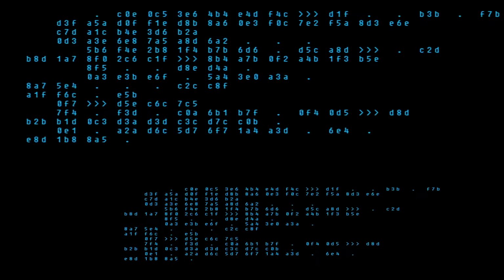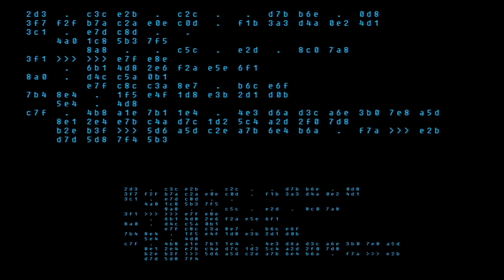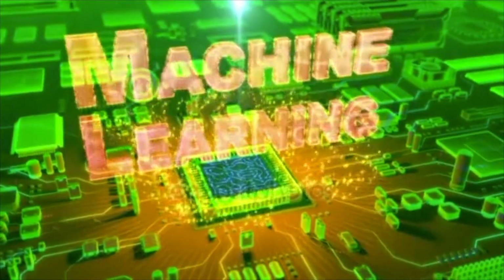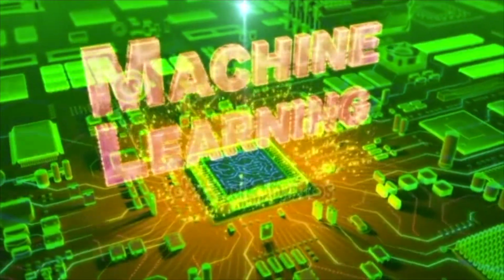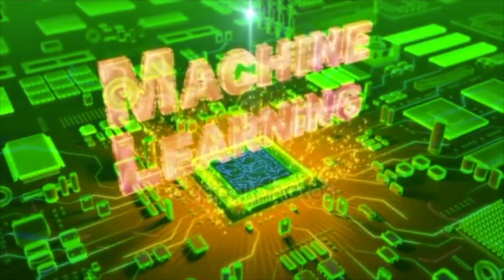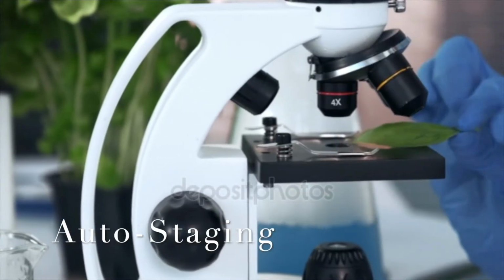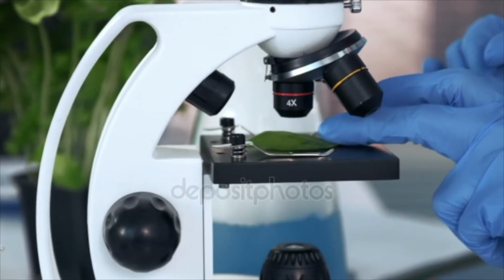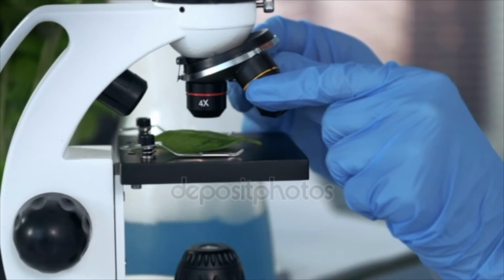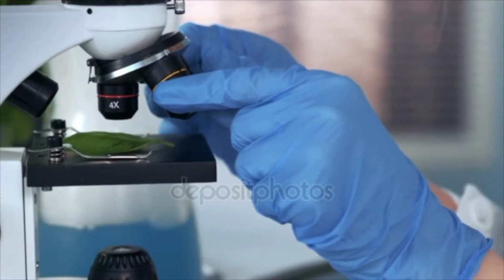The first section will use deep learning to detect the parasitic egg. In detail, we have implemented the algorithm based on single-shot multi-box detector and used TensorRT to optimize the inference process for computation reduction when deploying on the Jetson Nano microprocessor. The second task will construct the hardware and usage system by implementing the autofocusing system and user interface in order to comfort the user, most of whom will be medical professionals.